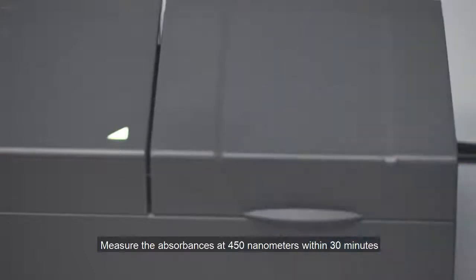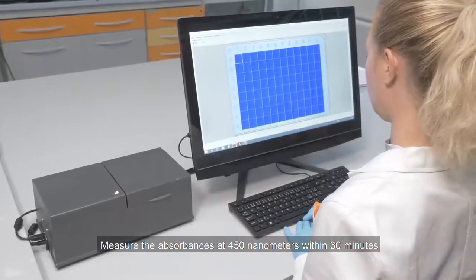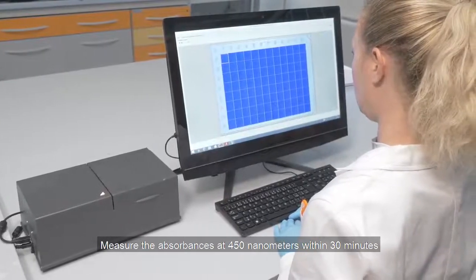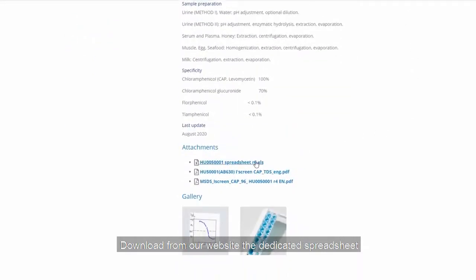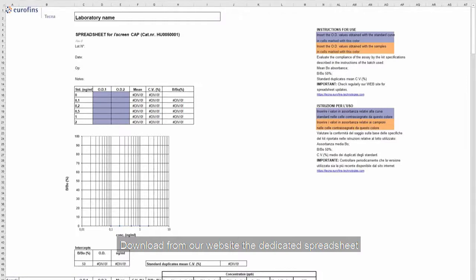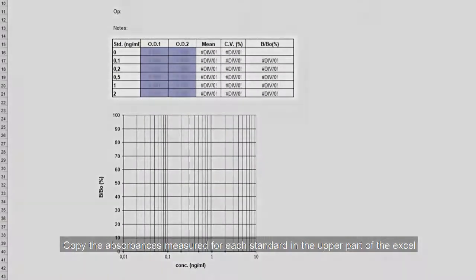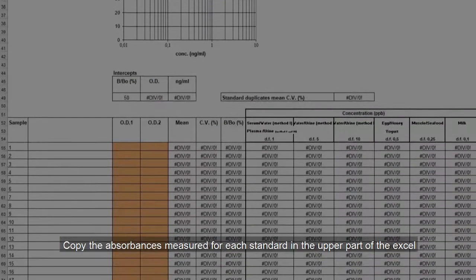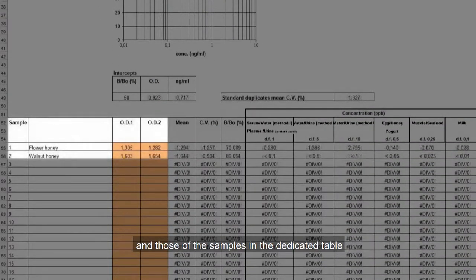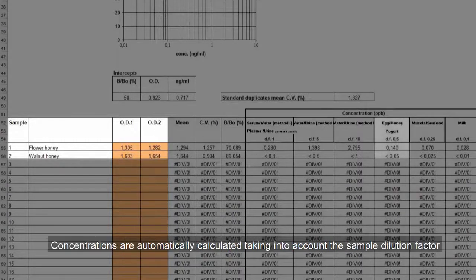Measure the absorbances at 450 nanometers within 30 minutes. Download from our website the dedicated spreadsheet. Copy the absorbances measured for each standard in the upper part of the Excel and those of the samples in the dedicated table. Concentrations are automatically calculated taking into account the sample dilution factor.